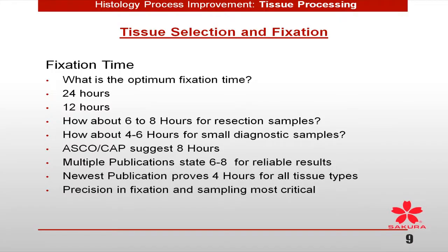The other thing we have to talk about is what's the optimum fixation time? 24 hours, 12 hours, 6 to 8 hours? Isn't that what ASCO-CAP tells you, that you have to have a minimum of 6 to 8? That's a resection sample, typically. How about 4 to 6? What is it? What do you do? How do you control that in your laboratory?